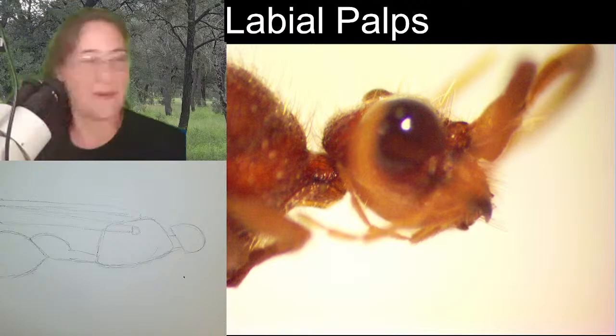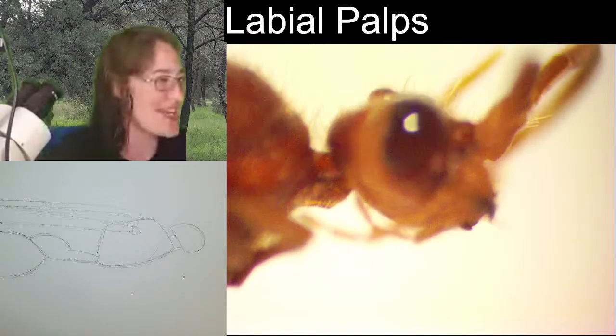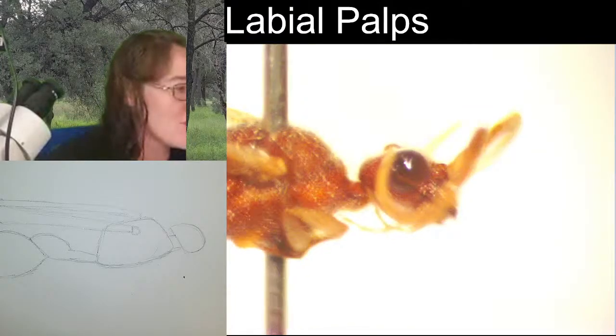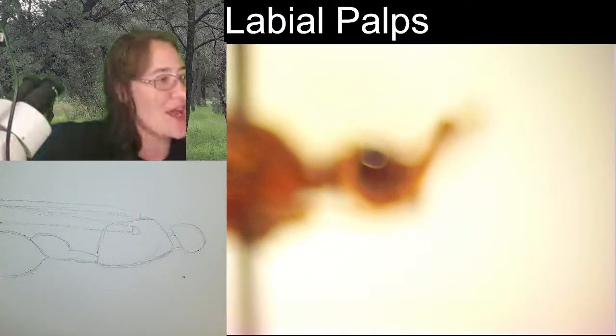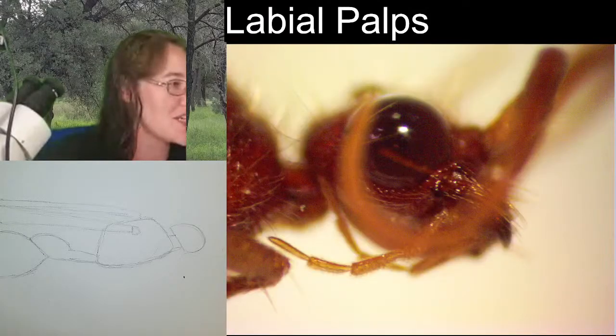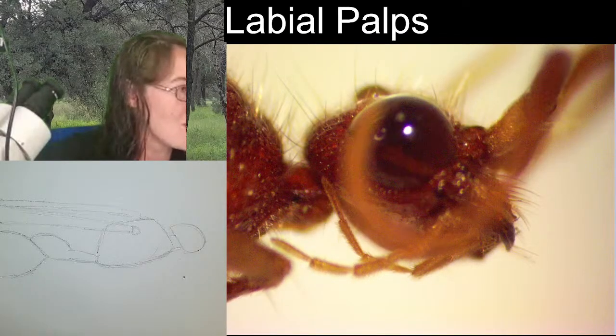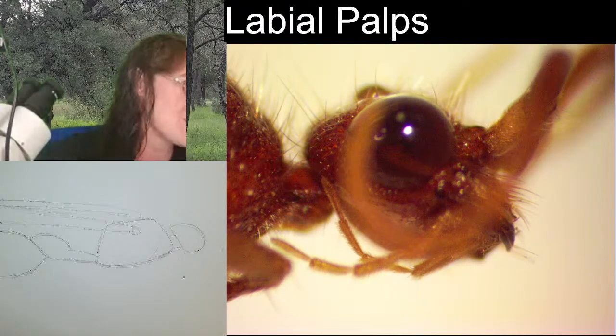Because that's totally what we're seeing here, and that's why I was confused. It almost appears to be, it's long, and they're long enough that they could be kind of short antennae. That's crazy to me. So right there, those are going to be the longer ones. Those are maxillary palps. You're so cute.